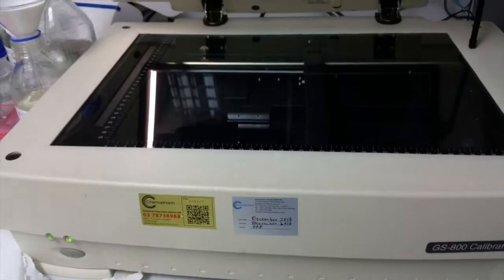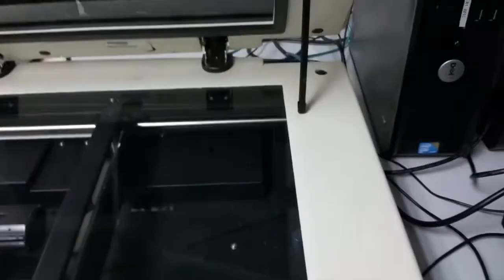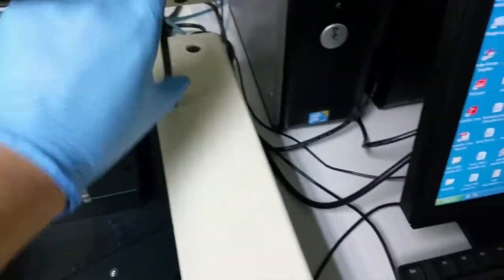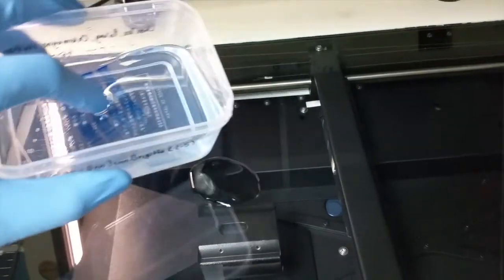The machine has warmed up. What you do is lift the cover, and you have this little hinge thing — you have to prop the hinge to make it stay open. Then you're going to pour a little bit of water on the surface so that when you put your gel down, it will stick on it.